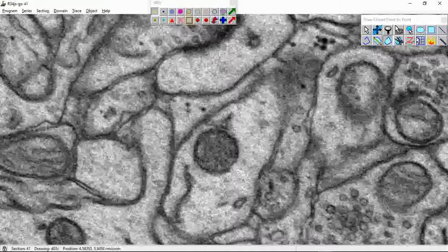The other tool that you can use is the draw closed by point tool, and with this tool you essentially click and extend your mouse, and then when you click again it creates another point and allows you to trace the shaft of the dendrite just by clicking from point to point. So this is the method I prefer to use, also because say I make a mistake and I start tracing all the way out here, which is not part of my dendrite.